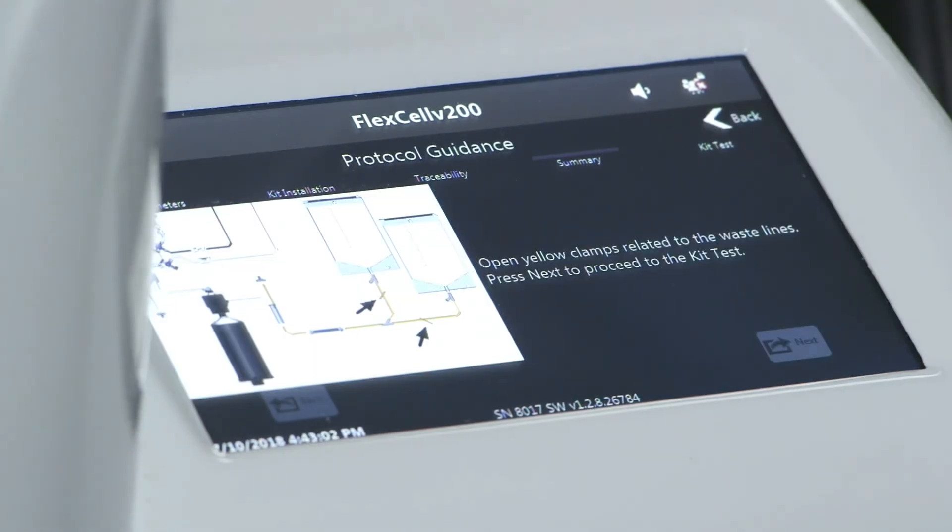And then start the process. A user guide integrated on the screen will intervene when the user's actions are required, showing which operation to be performed and related relevant messages.